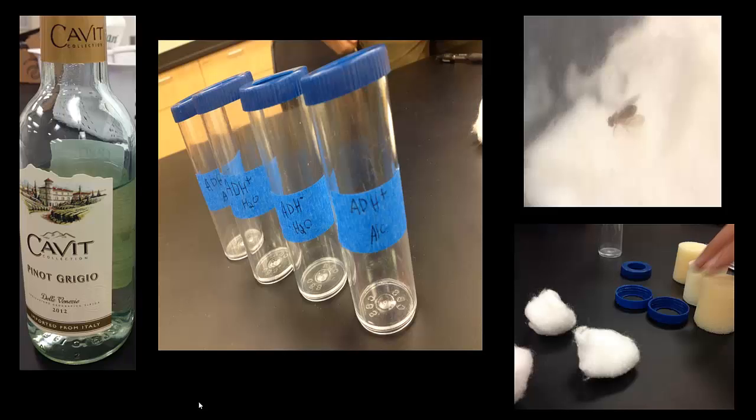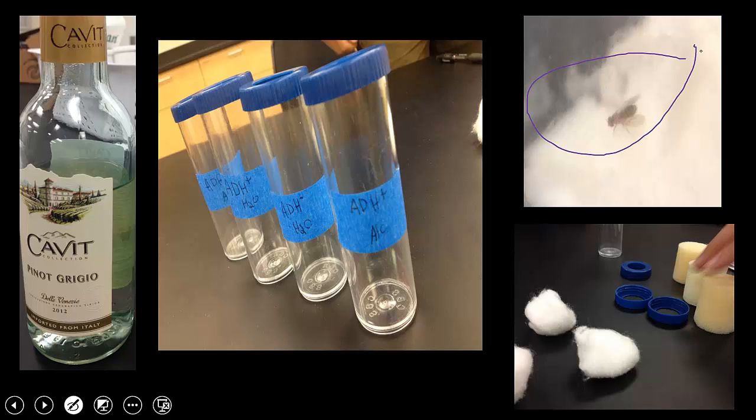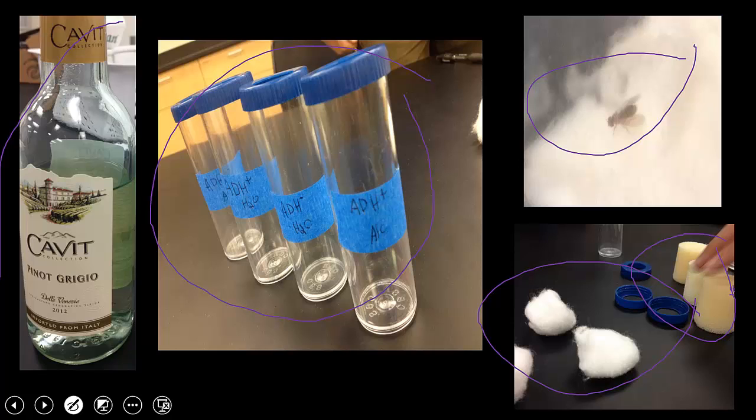For our equipment and materials, we used 12 fruit flies, 4 containers labeled as ADH positive and ADH negative for alcohol and H2O, 4 cotton balls to soak in the alcohol and water, as well as 4 stoppers, and our ethanol, which is this fine wine over here.